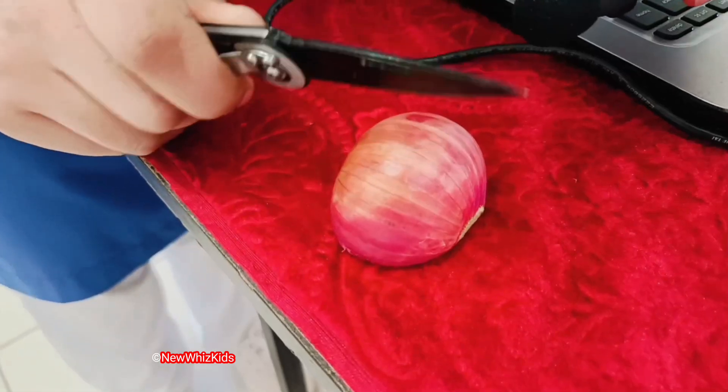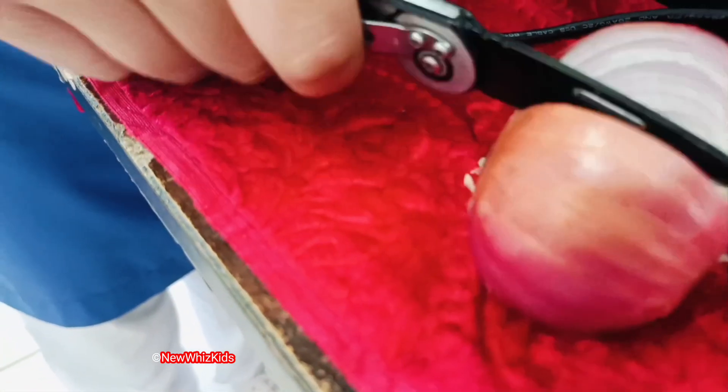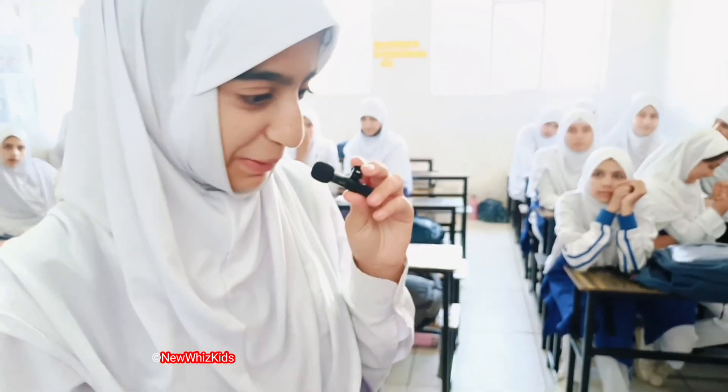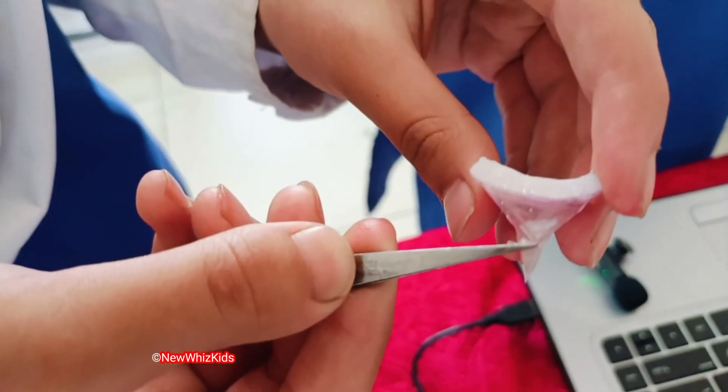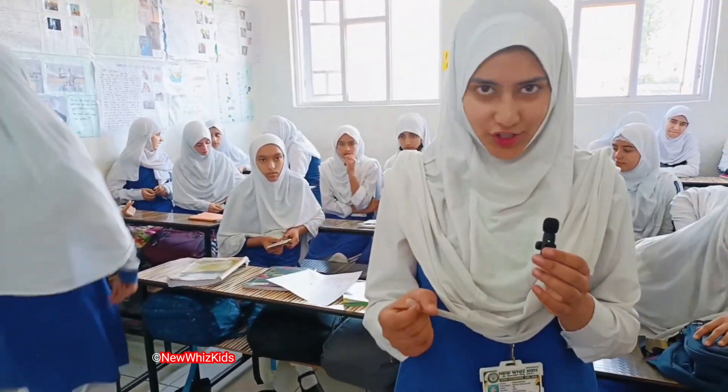The procedure is: cut an onion in two halves. Get a portion from the cut onion. Get a thin peel from the onion sample. Using a dropper, pour some iodine into the watch glass.